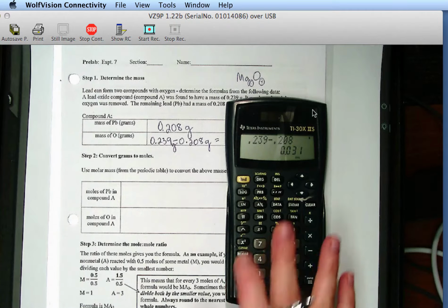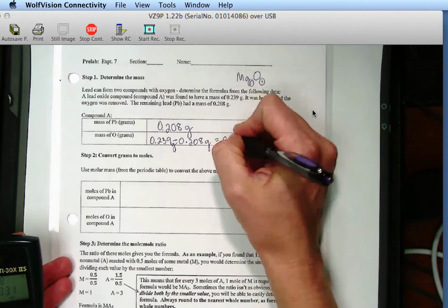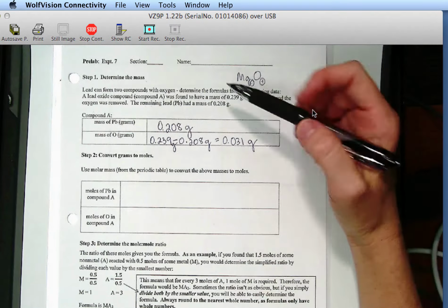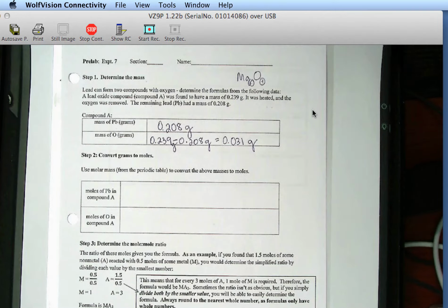How many sig figs should you record for that? So 3 after the decimal. Well, it's 3 after the decimal. So that's 2 sig figs, but 3 spots after the decimal, yes.